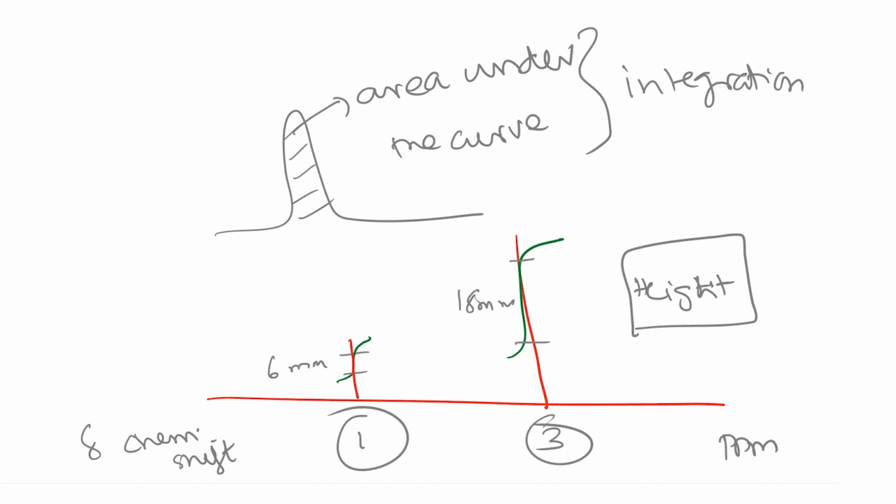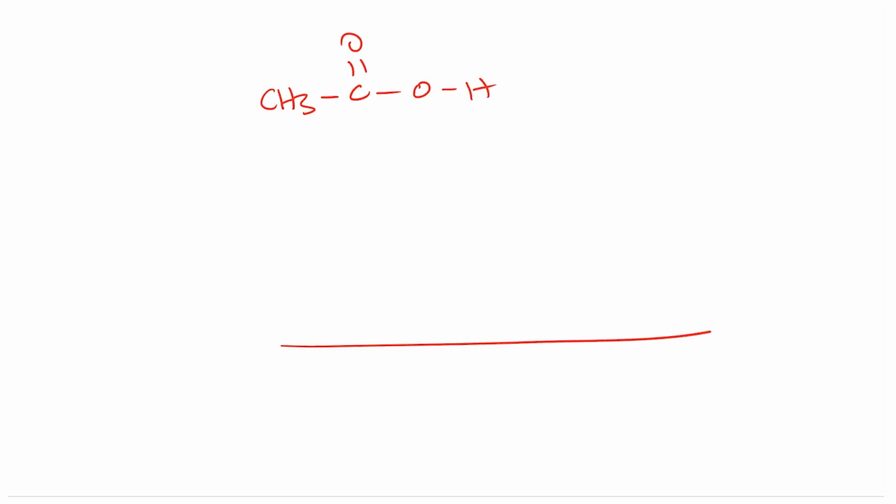All right. So, for example, when you look at molecules such as CH3, C double bond OH, and I record the NMR spectrum of this, do not worry too much about the position of these peaks as yet, we will get to that very soon. Let us say this is 0, and now I have to slightly extend the scale a little bit because of the OH. So, 2, 4, 6, 8, 10, 12. This is the delta ppm.